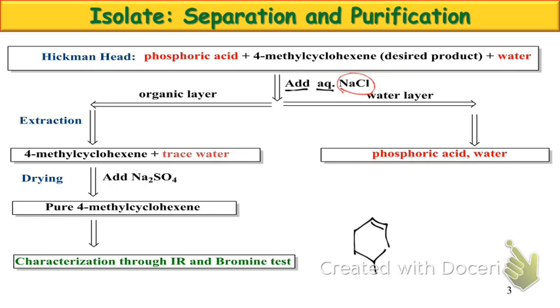Easier than that. A salt. Okay, why? Our very first step was to add aqueous sodium chloride. The sodium chloride is a salt. What was its role? To remove water.